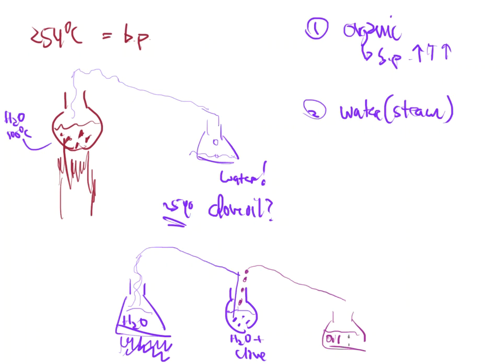Now, the problem is that that oil is also going to be mixed with a little bit of water. Okay, so water is going to come over as well as your oil, and you're going to have more water than you will have oil. I'll just go ahead and tell you that. It's no secret. You're going to have more water in the flask, on the collection side, than you will the oil. So how do you know when you're done? That's often the question that people have.